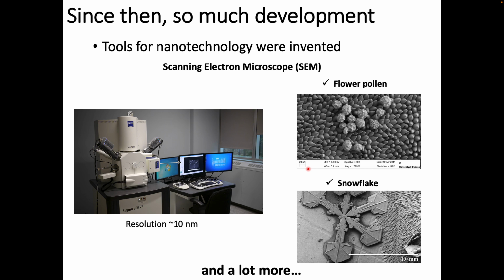Okay. And another unique feature of this tool is that it requires vacuum. Okay, so for an optical microscope, you don't need a vacuum, right? But for this one, you absolutely need a vacuum. Can you guess why? Yes. The electrons will scatter if they're in open air, so that electron beam will be very diffused by the time it got to the... Exactly.